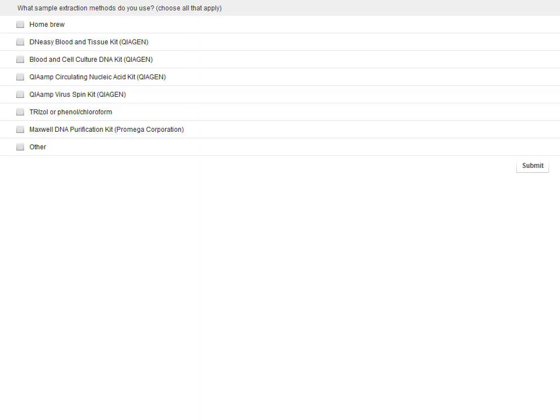So Dawn, can you just tell us what kind of results you are expecting from this poll question? Hi, Chance. Thanks. Typically, we see our customers using the QIAGEN kits as well as the Maxwell system from Promega. But depending on your region, different methods are predominant, so we're interested in what our customers are using. Each particular kit comes with its own limitations and benefits, pros and cons, and so we're always following up at this point since ddPCR measures quality quite well. We're measuring right now the variety of different sample types and how that impacts it.